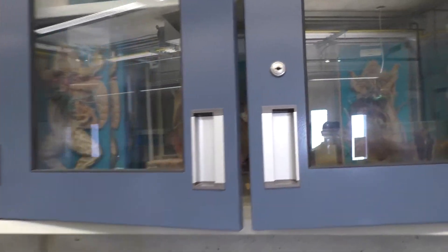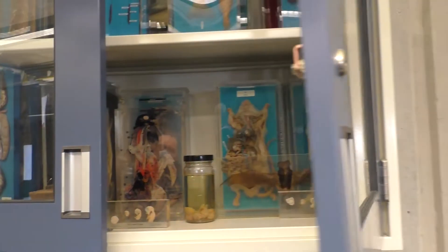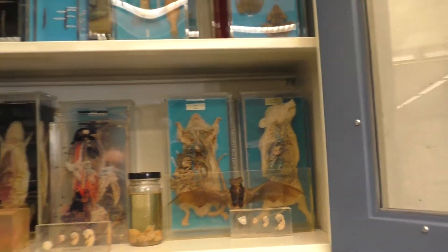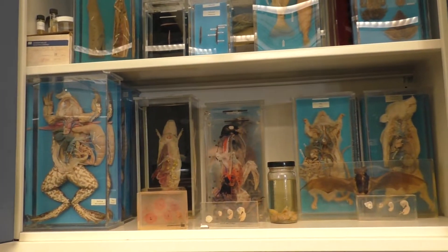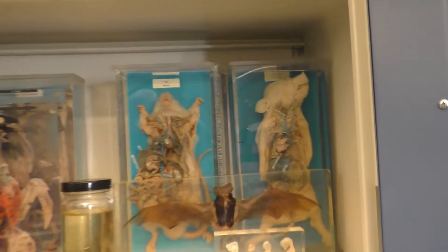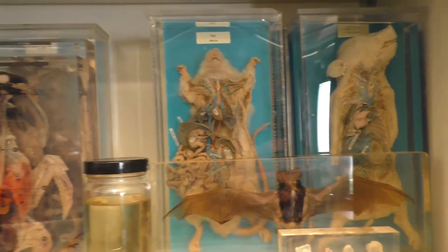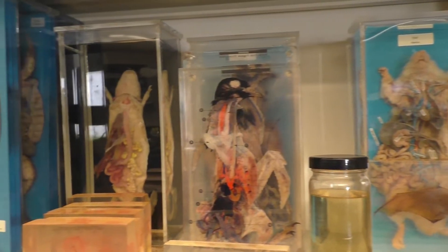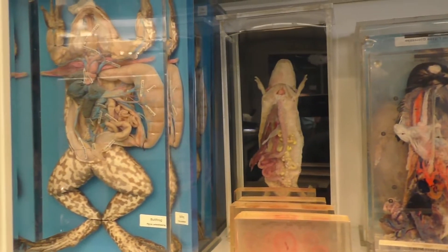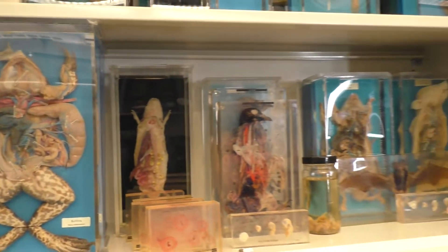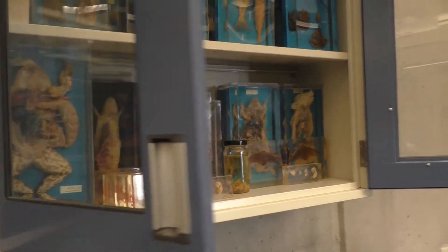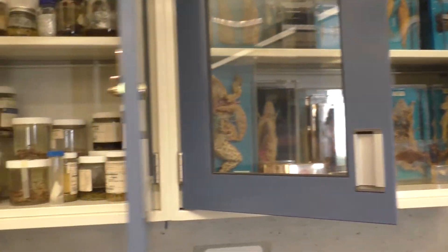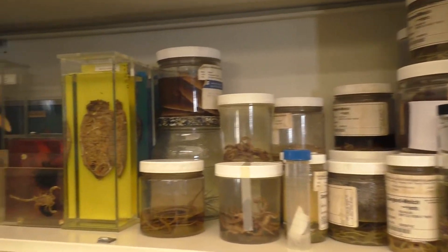To reinforce the knowledge, the students can use preserved specimens of different organisms, including vertebrates and invertebrates.